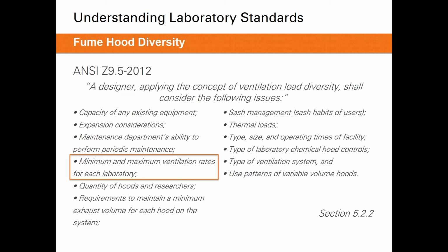The second thing to consider that's very important is the sash management, or the sash habits of the users. So when people are using fume hoods in the lab, when they open a sash and run an experiment, do they close the sash while that experiment is running, or do they typically walk away while it's open? That is an important consideration because it will be important to communicate that to the users.